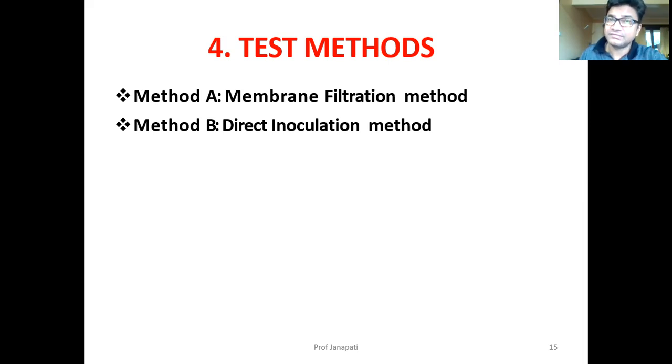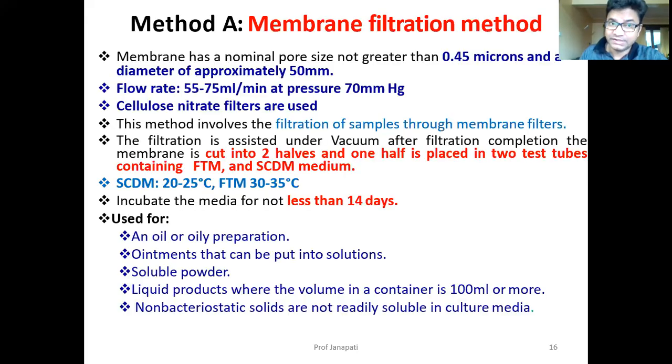The direct inoculation method you may feel is very easy, but you need to have an expert. In the membrane filtration method, you take the sample as specified, as we learned in step 1 and step 2, and filter it with the help of a membrane filter. Allow the sample to fall.